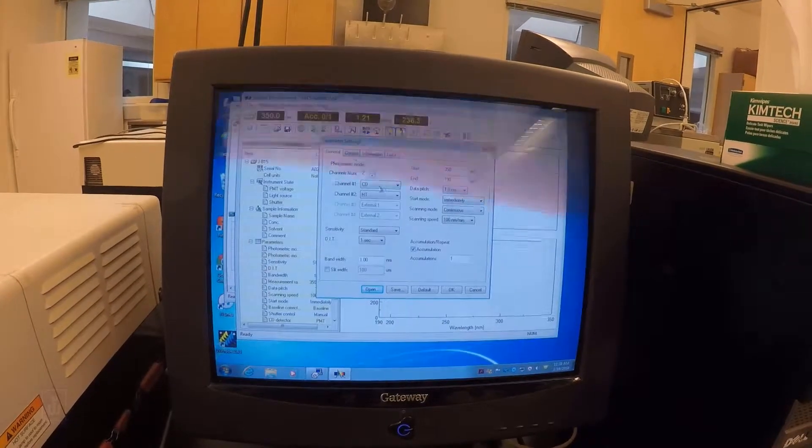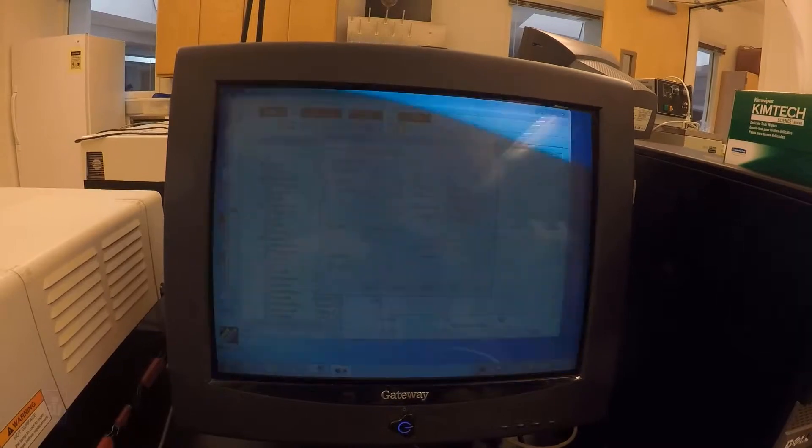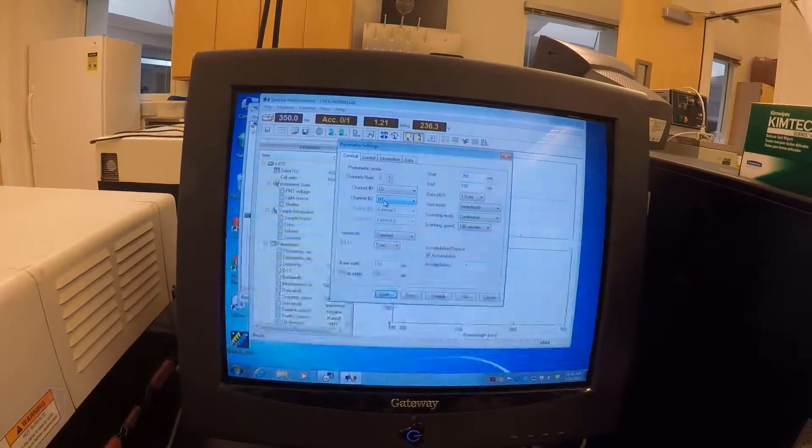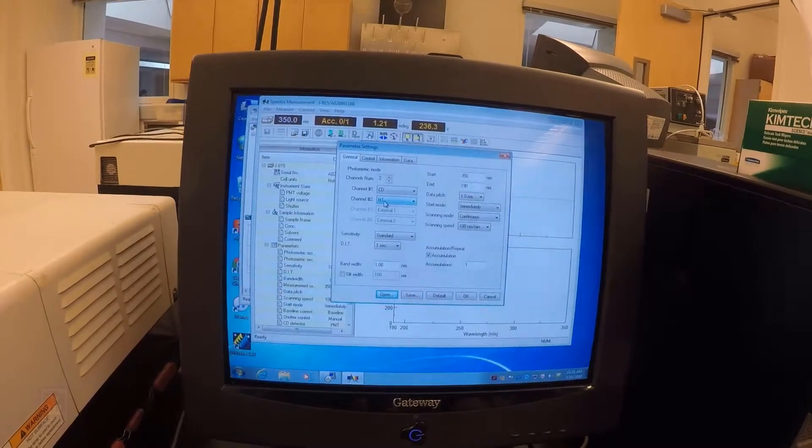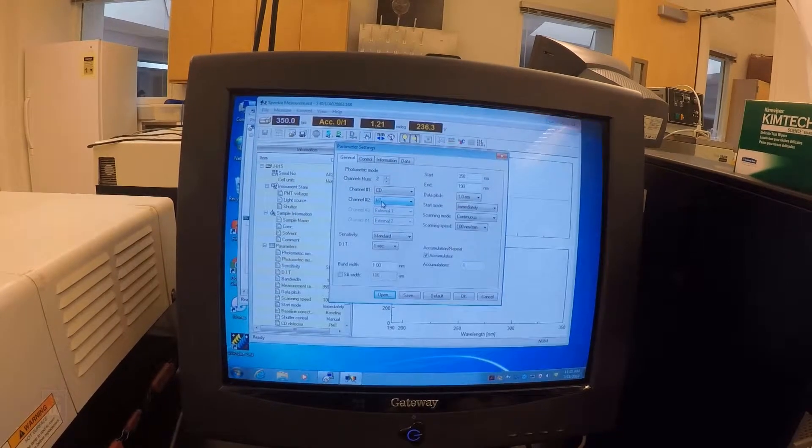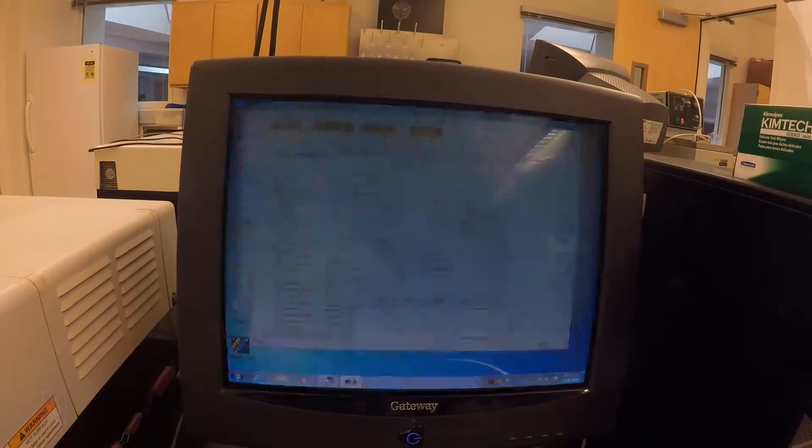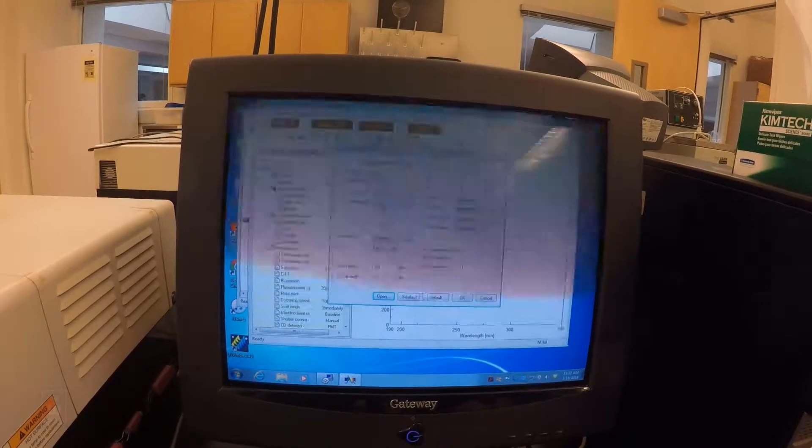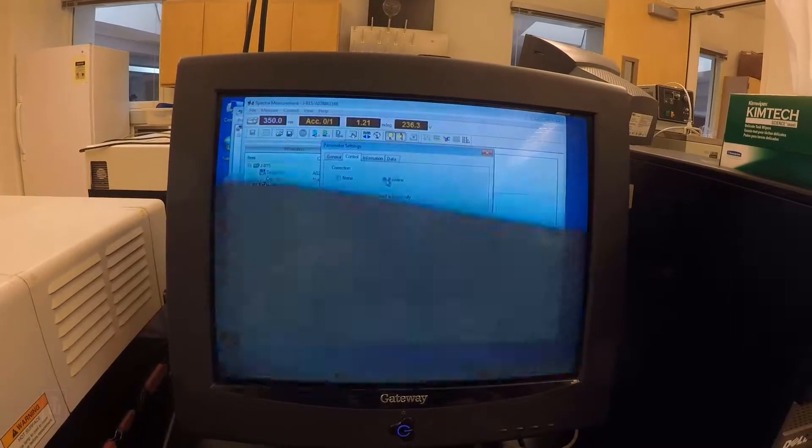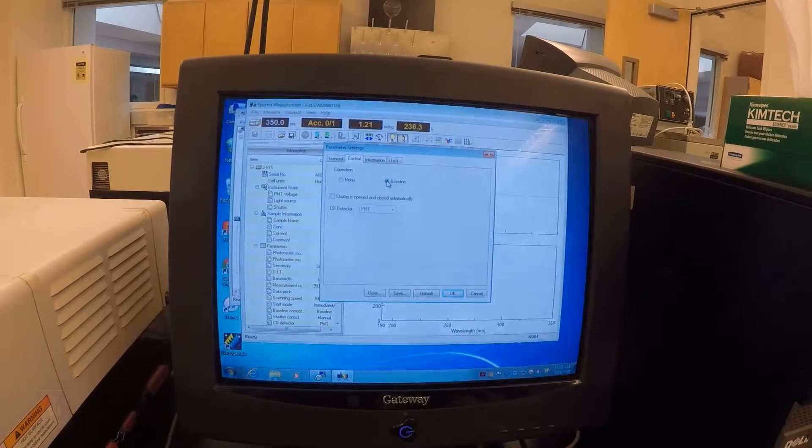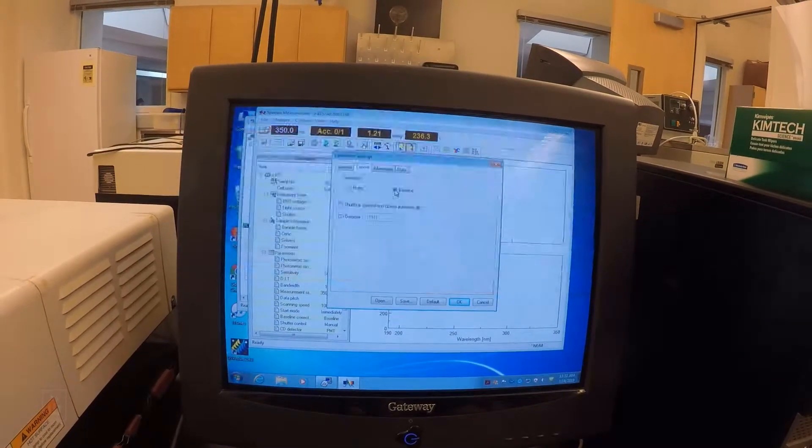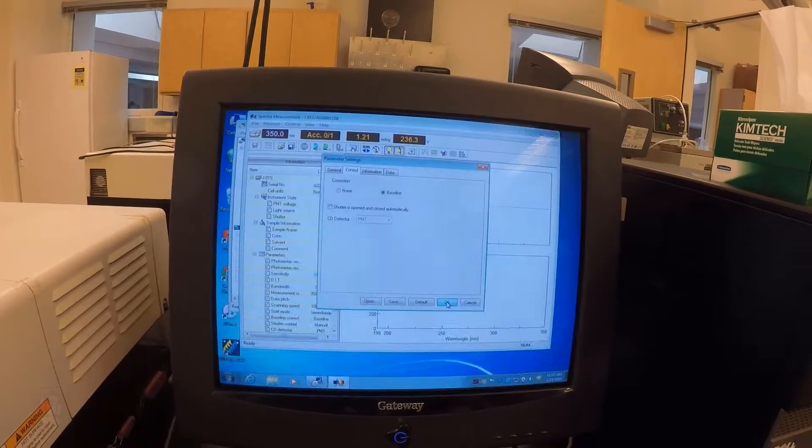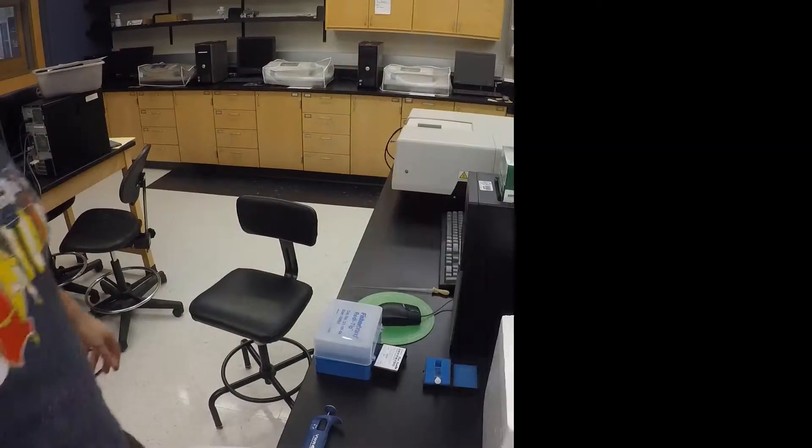The HT essentially is the gain on the photomultiplier tube inside of the spectrometer. It tells us how many photons are hitting the detector and uses that to adjust the gain to turn the volume up as fewer and fewer photons come through as oxygen starts to absorb them. And then I'll just go ahead and make sure I have a baseline control. This is going to subtract out my blank, so I'm going to have a buffer scanned separately, and I'm just going to hit OK.